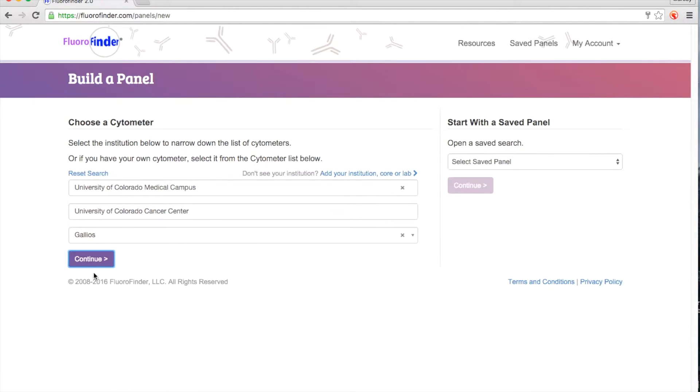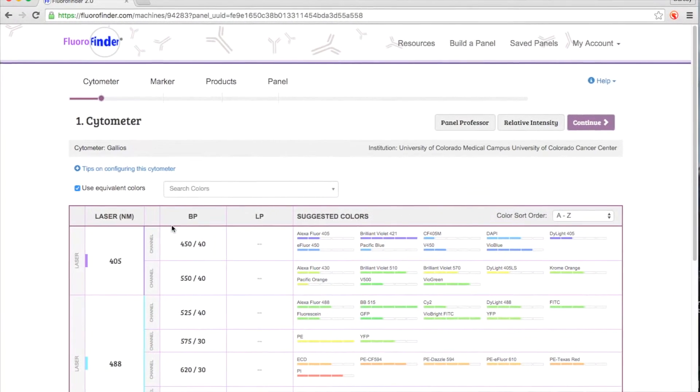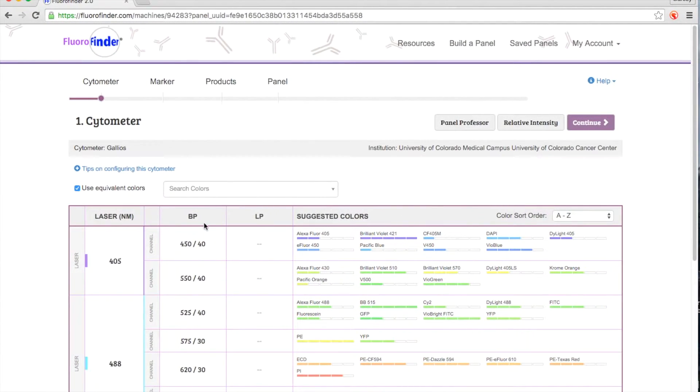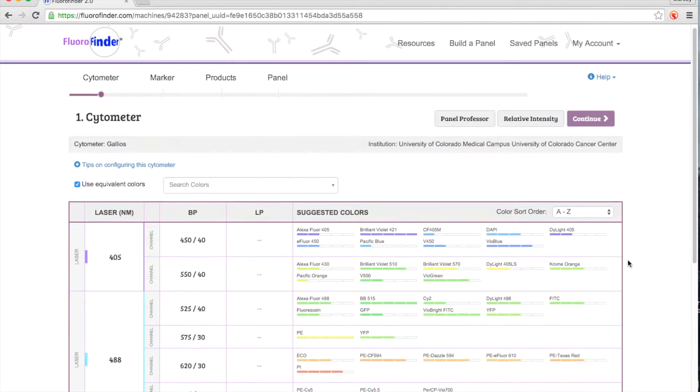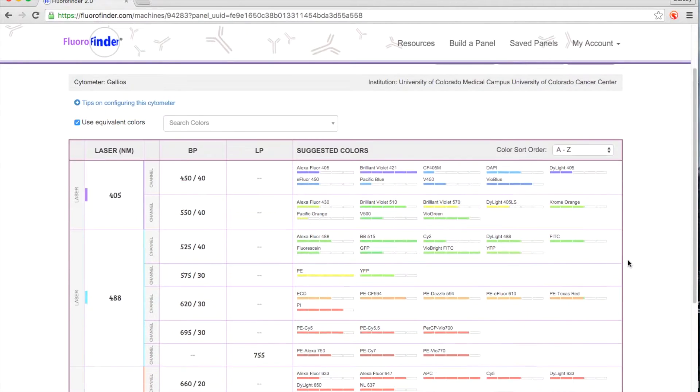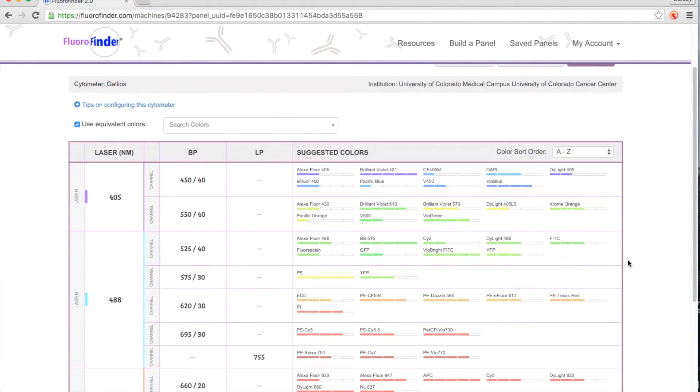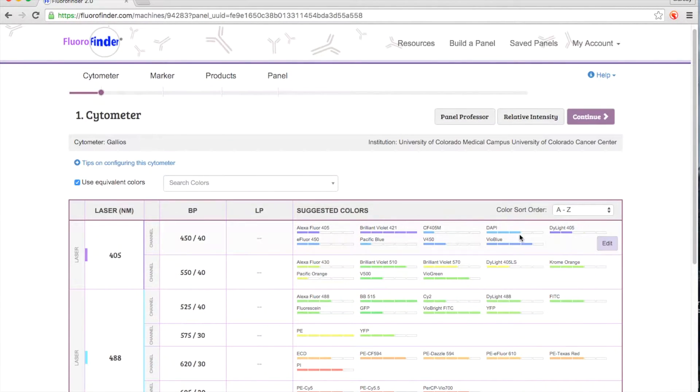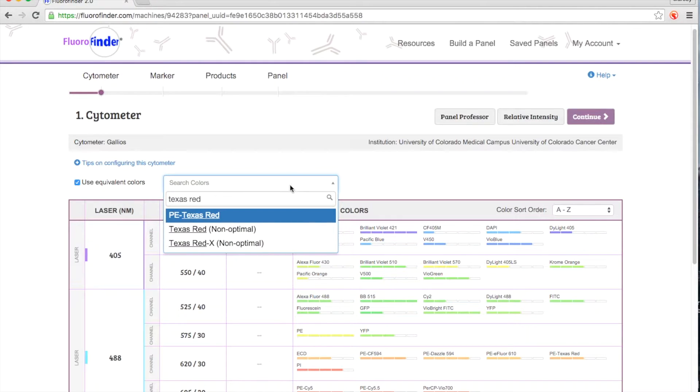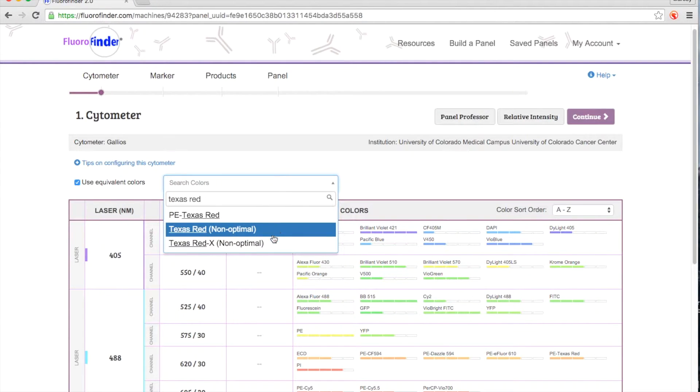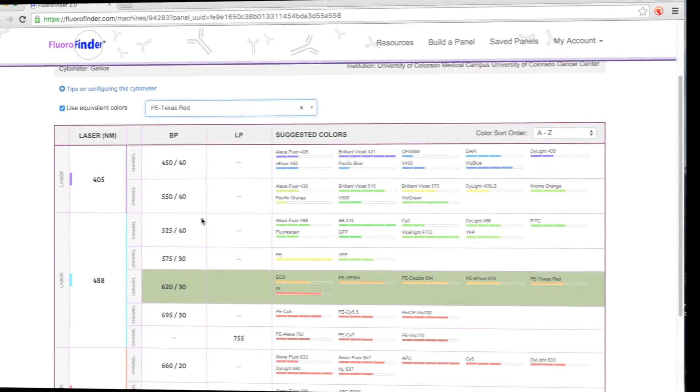you are directed to the first step of the panel design process. On the first page, you get a comprehensive overview of your instrument configuration. You can view the lasers, filters, and dichroics, along with the suggested colors for each detector. This visual can help you determine if you have chosen the appropriate instrument for your experiment and verify the colors you want to use are listed in the appropriate detectors.